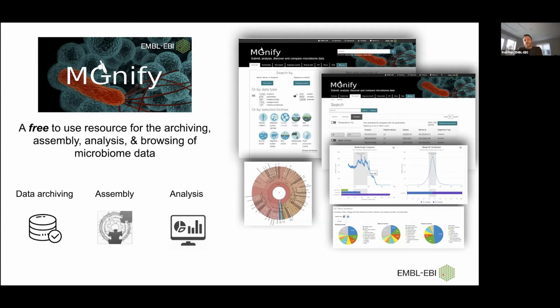And I'm not going to go through all of the views, but we provide a veneer of a website onto this data so you can start browsing and accessing that data and you can search it. But over the last few years, metagenomics has become our mainstream analyses, and also the generation of not only assemblies, but trying to recover genomes.